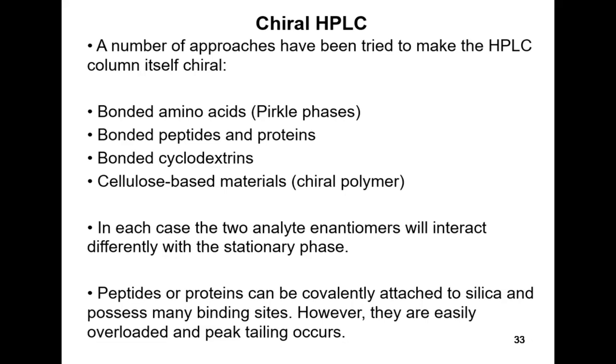Okay. Nice. Do you know what kind of modification was on the stationary phase? I don't know. It's a similar column, looks like an HPLC column, but thick and very long, actually more than 2 feet long.